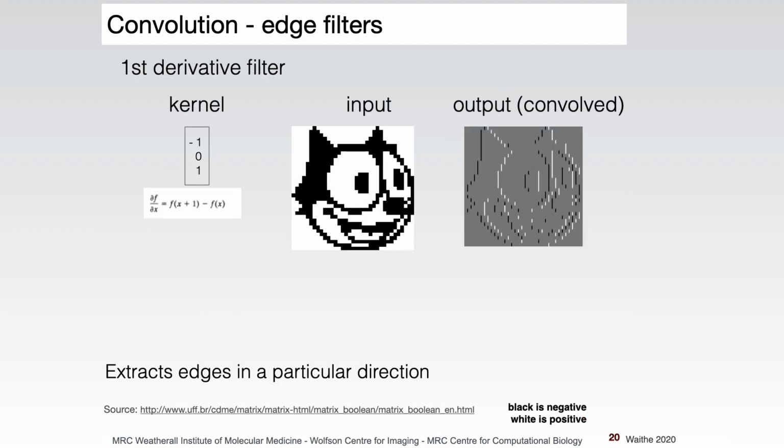And here are some other filters. A little intuition for a filter is that it tends to enhance the features that it looks like. This is quite hard to imagine with the smoothing filter, but if you have other designs of filter, then basically they try and extract signals in an image that look like the filter. This is an example of a 1D edge filter, where we just have -1, 0, 1. So this kind of looks like an edge, right?